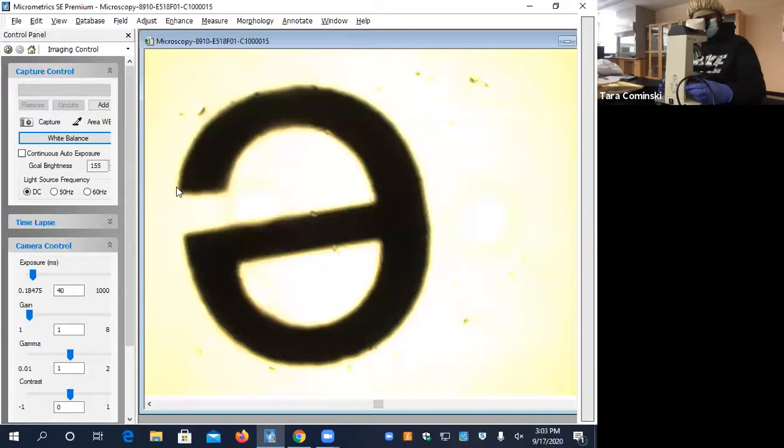You got it in the middle here. So get it in the middle. All right, now I'm going to start you here. Look in there and then turn it this way slowly until it comes into focus. That big knob here is the coarse adjustment knob. So you look and you turn it slowly, and it should come into focus for you.